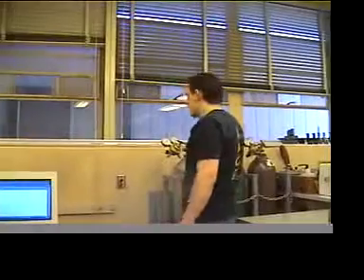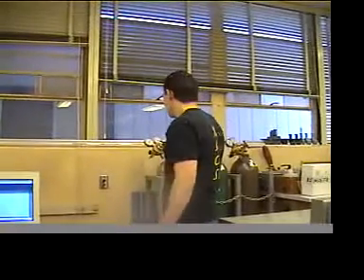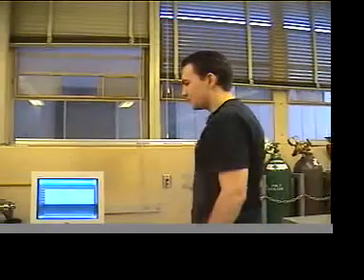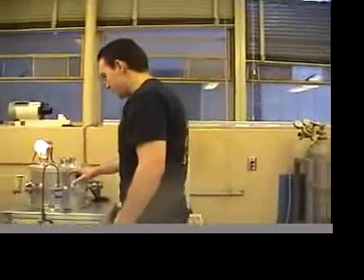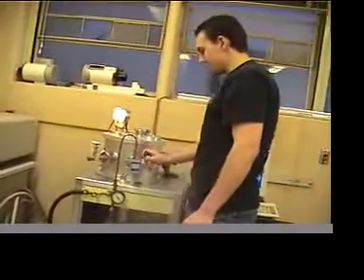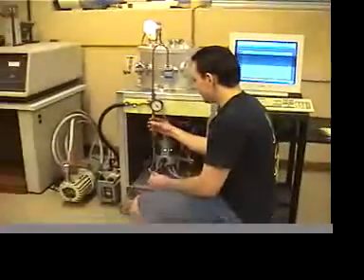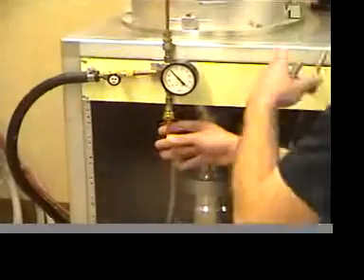Once you've done that for one of the gas tanks, you can repeat it for all three tanks. You'll probably want to do helium last because it has small particles and it's hard to get out of the line. Once you're done with all three of those, when you're done with each one, you'll want to close this again so that you can let this tube out easily because then it'll release the vacuum.